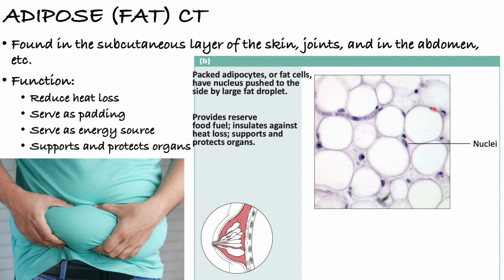If you remember skeletal muscle tissue, they have peripheral nuclei. So when you're studying this, I would like you to be able to compare and contrast. Okay, what other tissue will have peripheral nuclei? So these are large fat droplets, and each individual one is a fat cell.